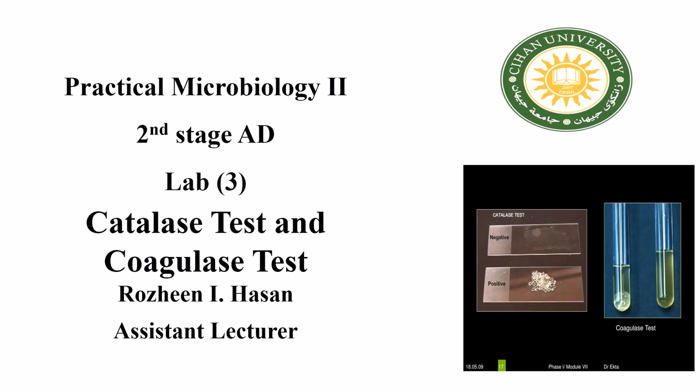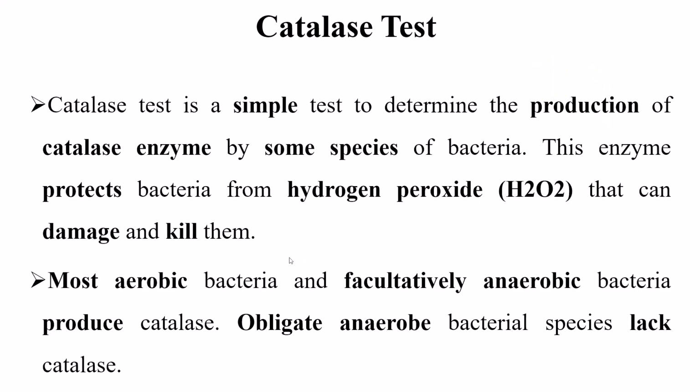Hello everyone, the third lab of practical microbiology for the second stage anesthesia department will be about the catalase test and coagulase test. The catalase test is a simple test to determine the production of catalase enzyme by some species of bacteria.